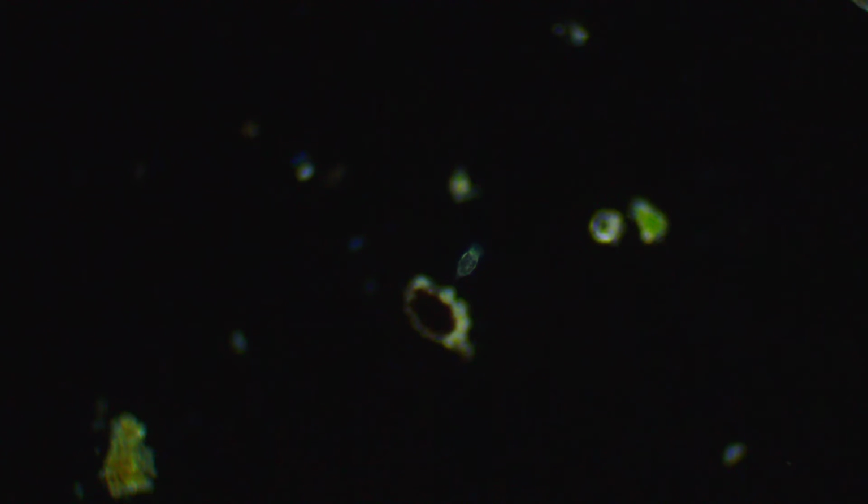I don't know, maybe that's the thing that I thought was a tardigrade, because he does seem to have little feet on the bottom, but I don't know. Rotifer. Yep. You can just barely make him out. He's sucking up water. He's stuck to a piece of moss, and he's out there with his little wheels.